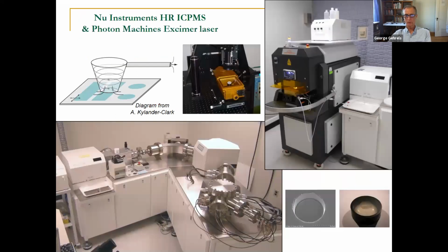Okay, well, let's just talk a little bit about the measurements, and then we'll look at some data and see how we're going to use this information. The setup is exactly the same. It's a multi-collector mass spec. The laser fires away and drills a hole into the zircon. We usually use a larger spot, about a 40 micron spot. We'll drill down a little bit deeper, maybe 25 to 30 microns deep, and that's just to gather enough ions that we can get the precision that we need for hafnium isotope analyses.